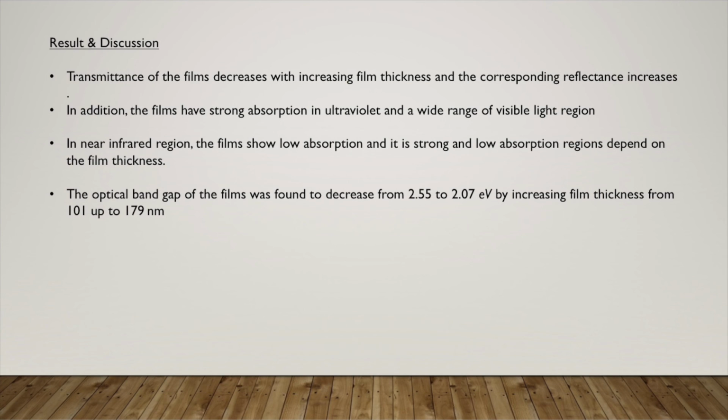In the near-infrared region, the film shows low absorption, and the strong and low absorption regions depend on the film thickness. Besides, the optical band gap of the film was found to decrease from 2.55 to 2.07 electronvolt by increasing film thickness from 101 up to 179 nanometer.